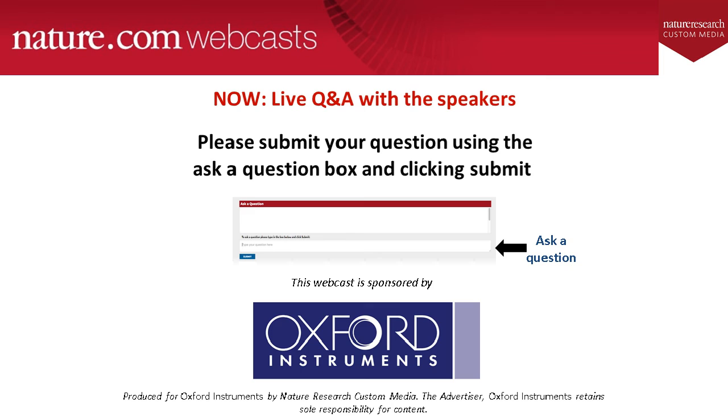So after you are finished using the detector, you retract it and warm it up, and then you need to wait a good 20 minutes to make sure that it's properly warm before you vent the microscope. That's very important. Once it's warm, then it's okay to vent the microscope and you don't get contamination.